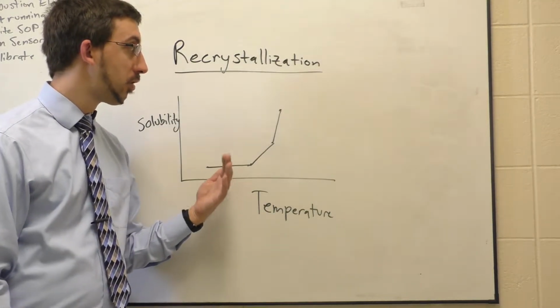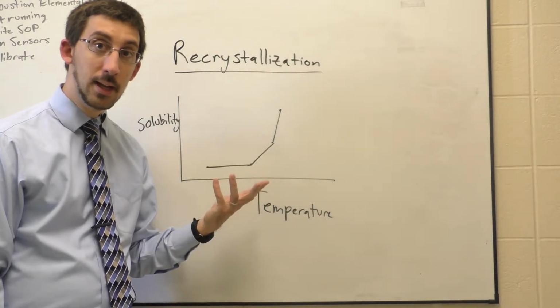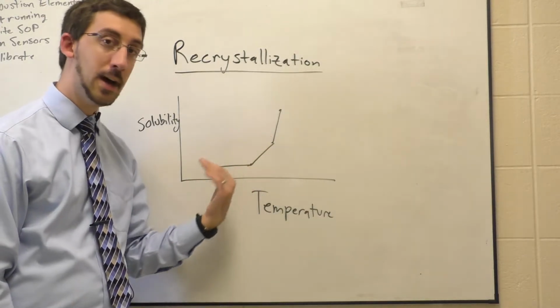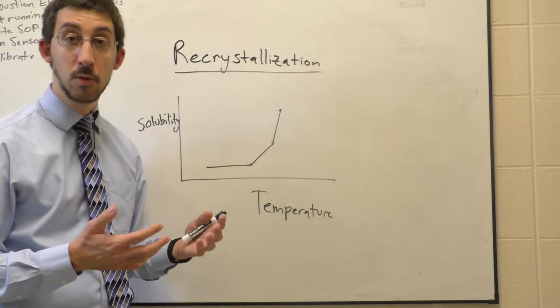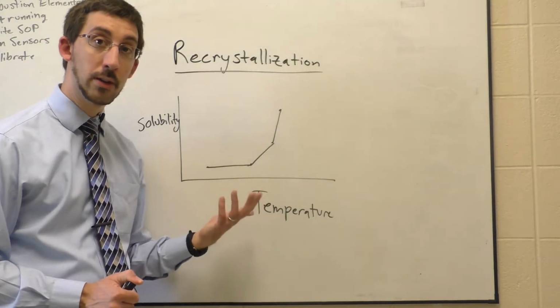Additionally, if the solubility of the impurity is greater in that solvent than the solubility of the compound, then when it cools back down, that impurity will remain soluble in the solvent and may be removed simply by filtration. And that's essentially what's going to occur in this experiment.